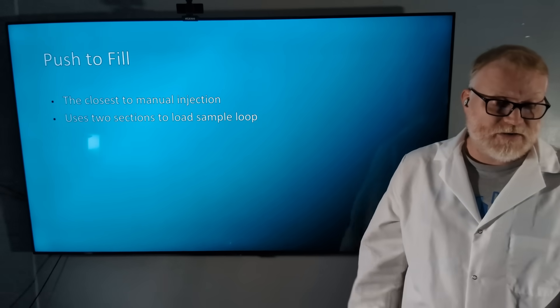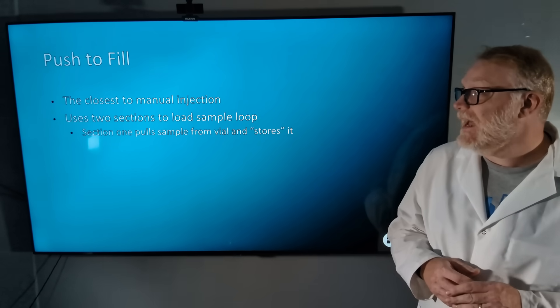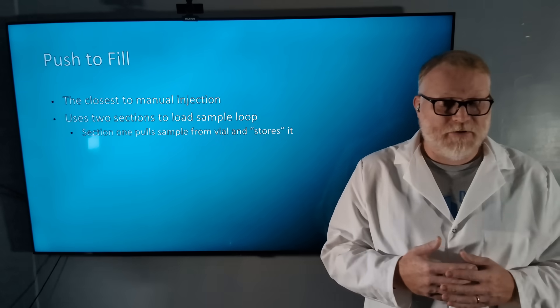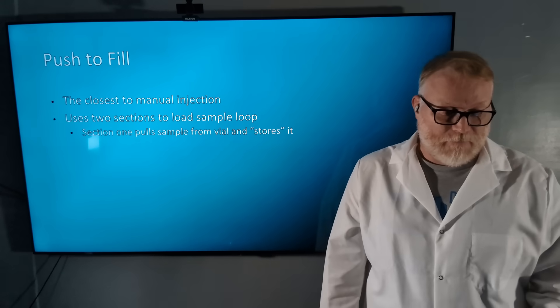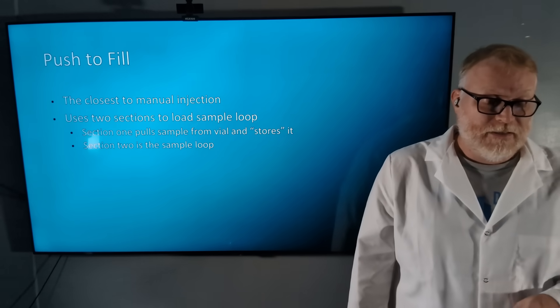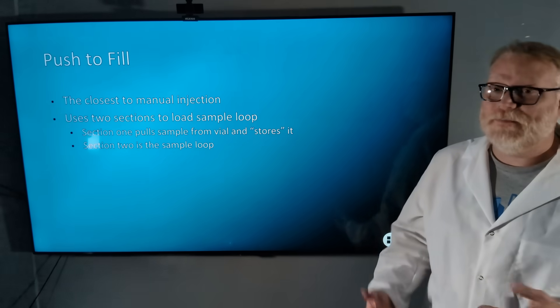The first one is called the aspiration capillary, where it pulls sample from the vial and stores it for a slight period of time before putting it into the loop. The second is the sample loop itself.